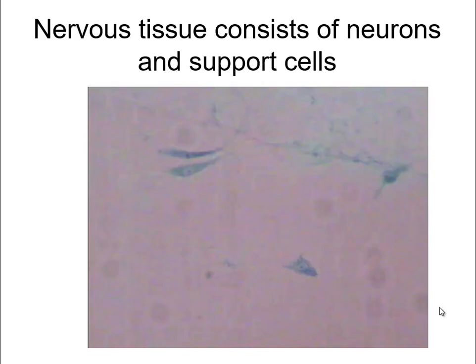When you're looking at cells it's very hard to see most of them because they're almost transparent and colorless. So we usually add a stain to make them more visible. Here you see some of the nerve cells with a little bit of staining. They generally tend to look like kites with tails.